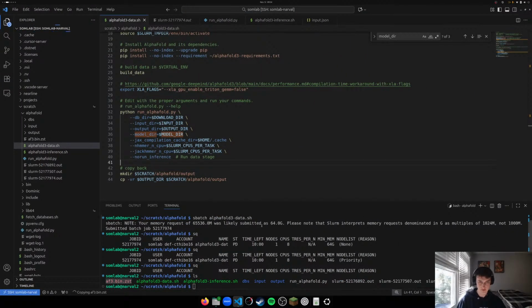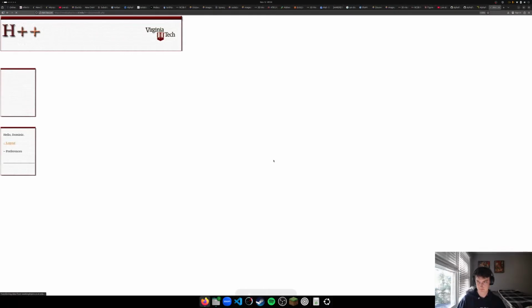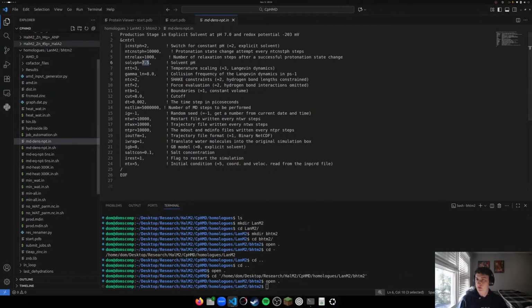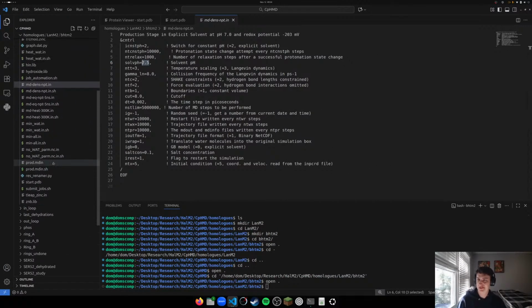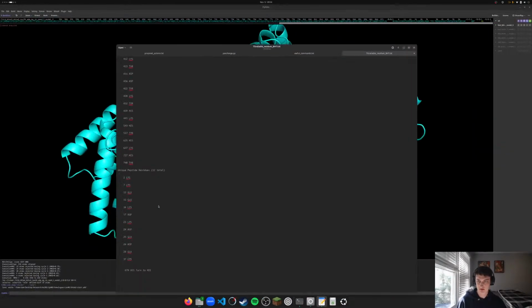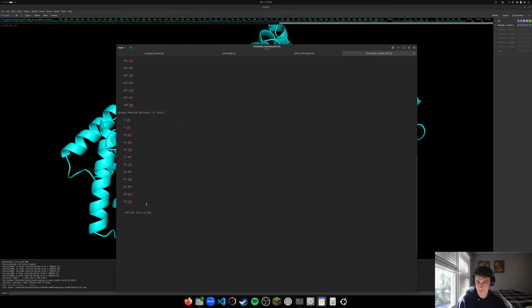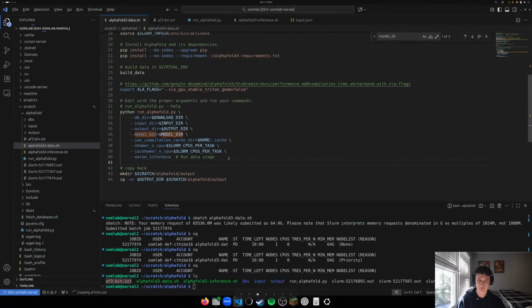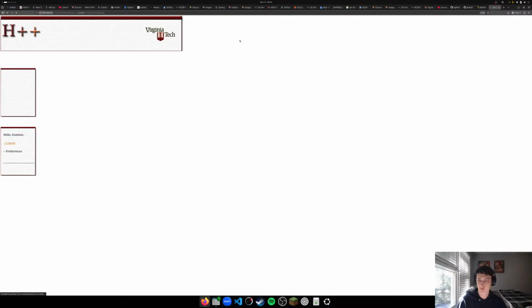Okay, this is still taking forever. It's only like a gig. What else can we do? I guess we can convert this into a command. So I'll just ask ChatGPT to do that for me.